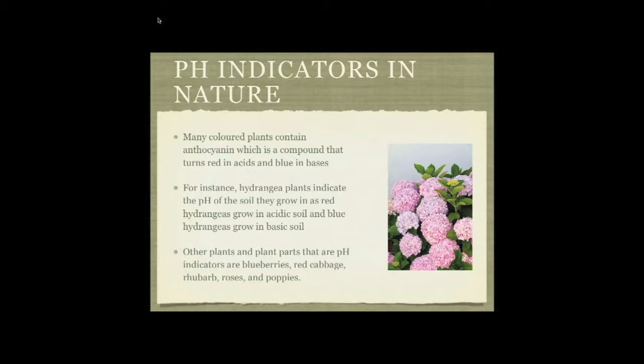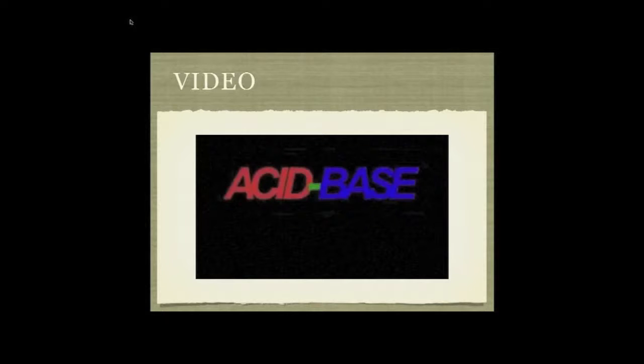Here is a video that will show the acid and base indicators. Here is a short video illustrating acids and bases in action.